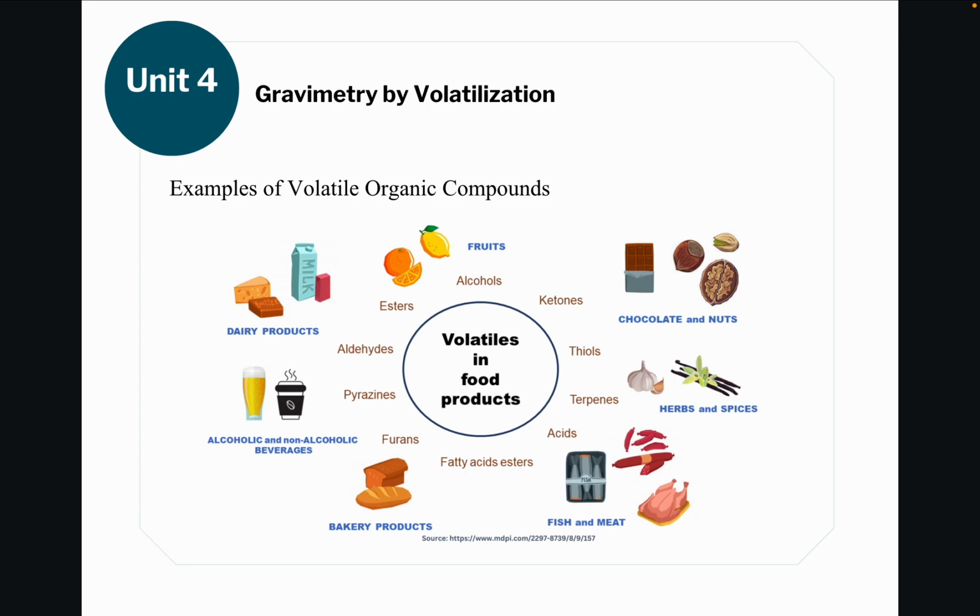The method can be done by combusting it in a furnace. So we have an equipment called the furnace. You can ignite or combust these materials, specifically the organic matter, and weigh the remaining ash in order to obtain its inorganic ash.